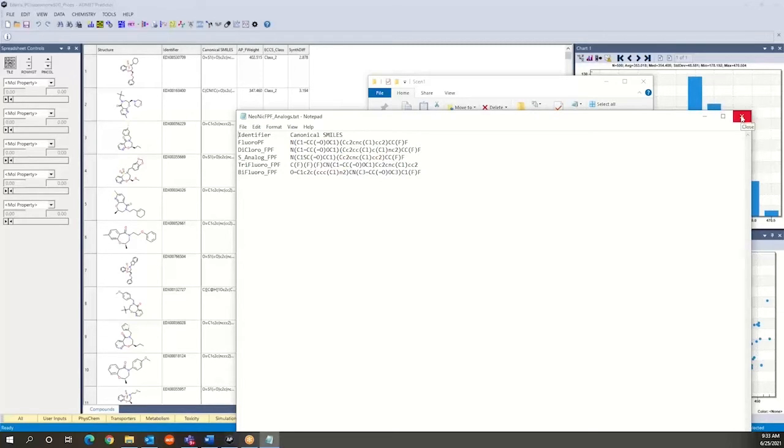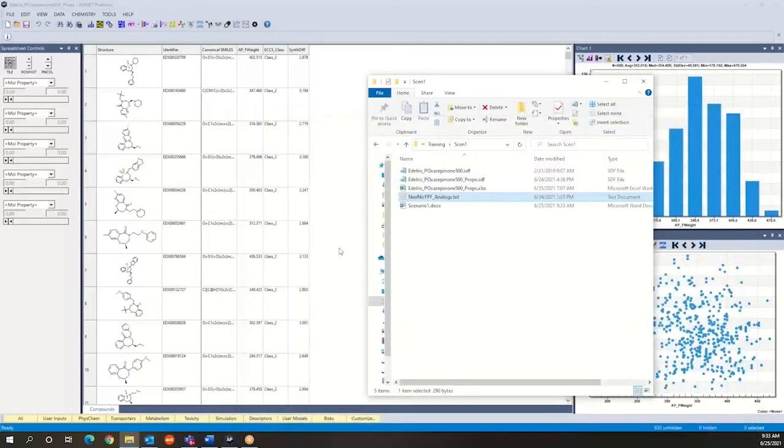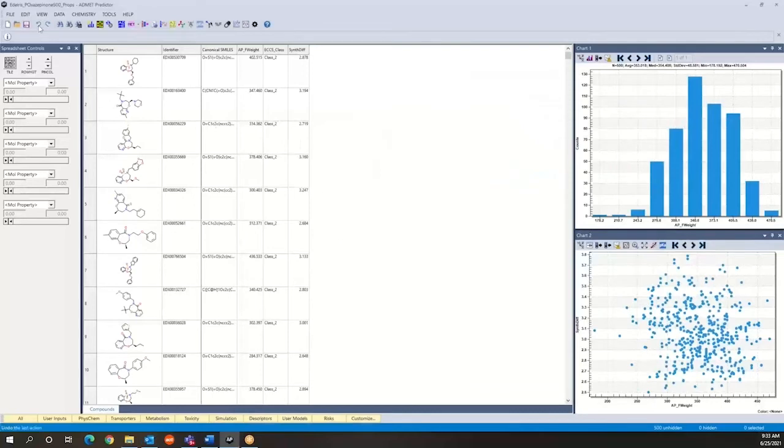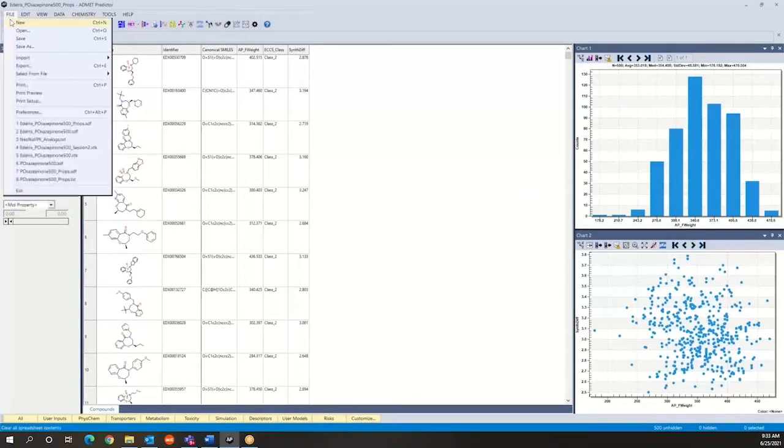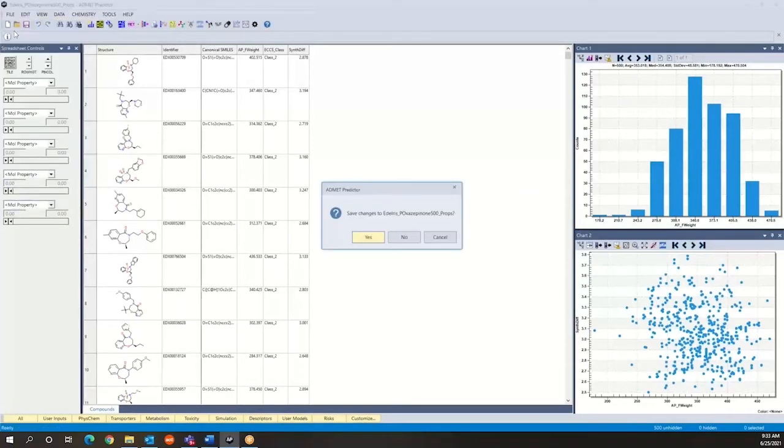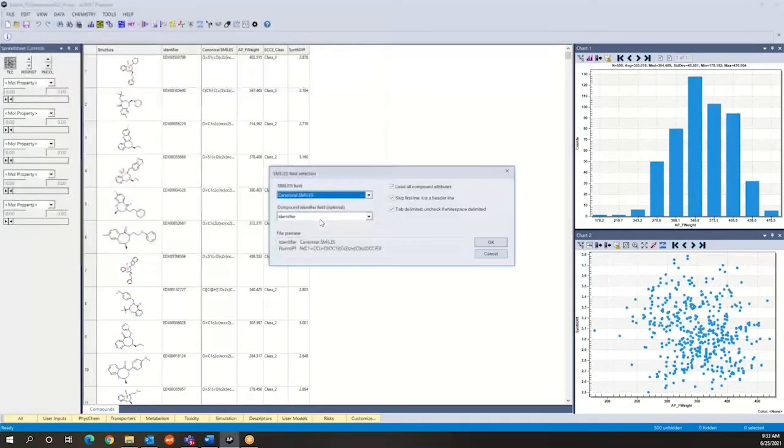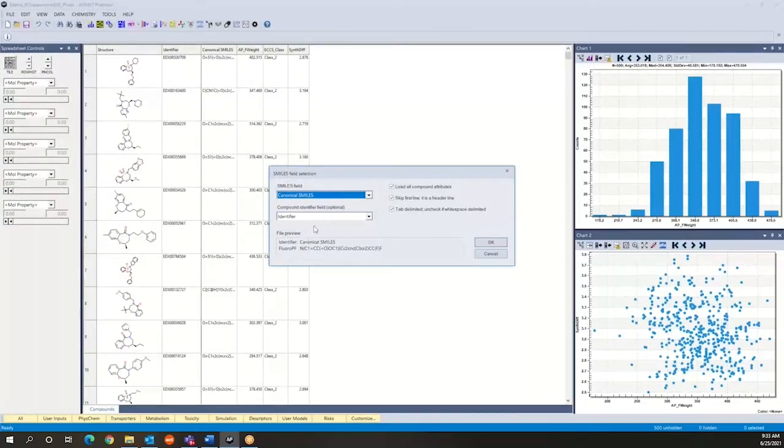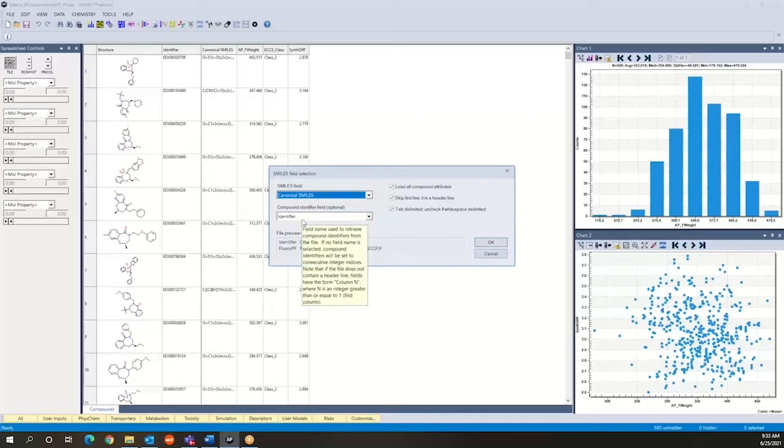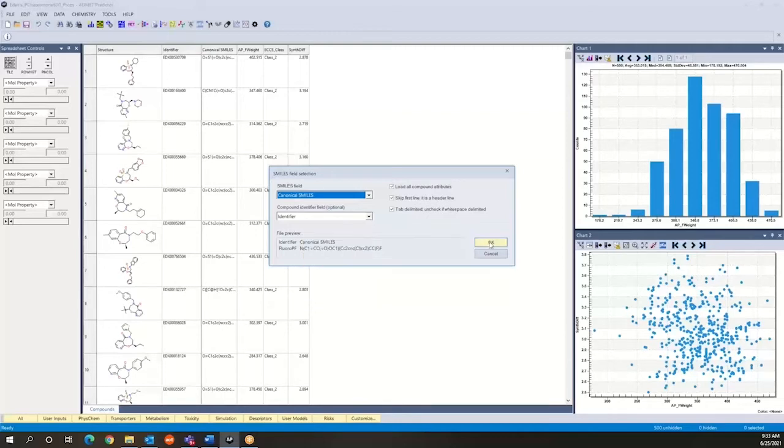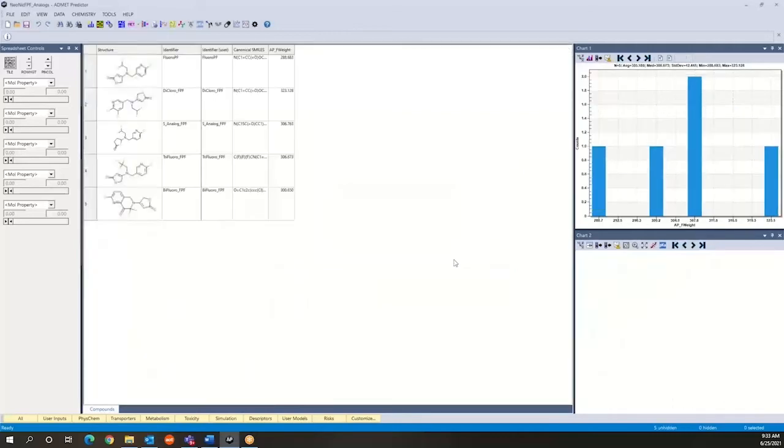And so it's very easy in AdMet Predictor likewise to load these compounds, simply use the same open command, pull down, and just select this file. So the program recognizes that there is a smiles field and also that there is an identifier column that is going to provide the name for each one of these compounds. So just click OK and then the compounds are going to load in a similar way that we've loaded compounds before.